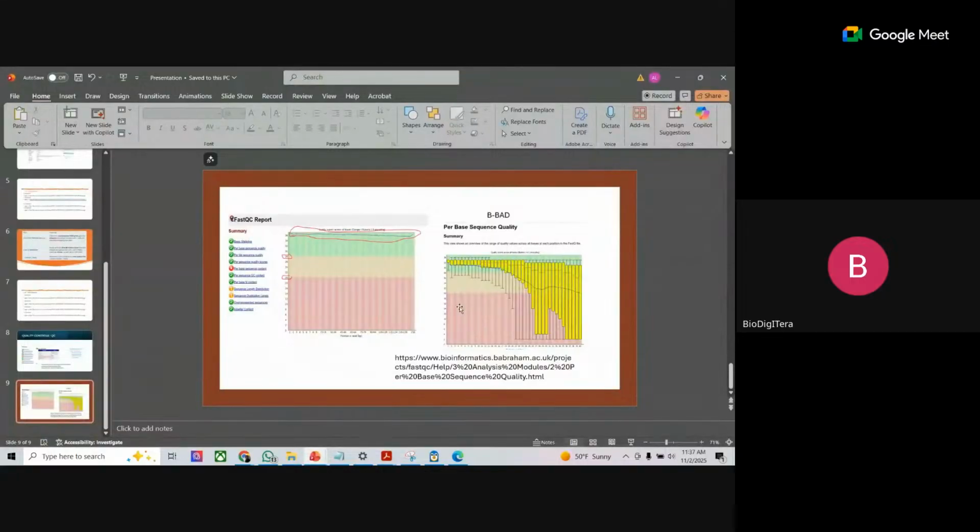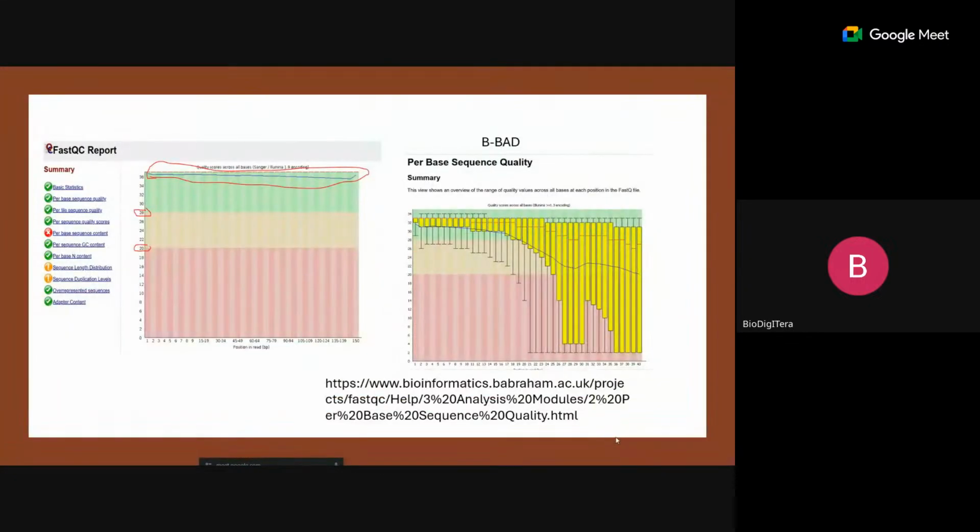To visualize, I put them side by side in order to explain to you. Each spot here, for instance, this spot, we don't have any here. You see this first blue line. This blue line is in the green area. And you can see that we have the yellow area and we have the red area. Here, I circle this. We have 20, 29, 28, and something around 30.